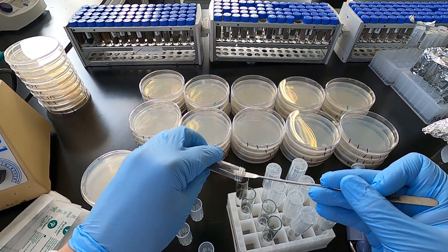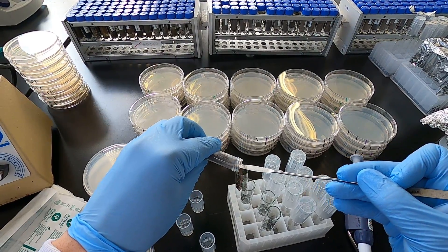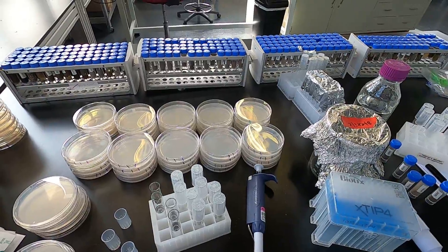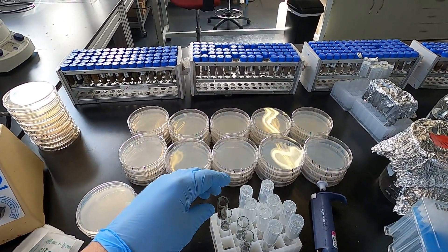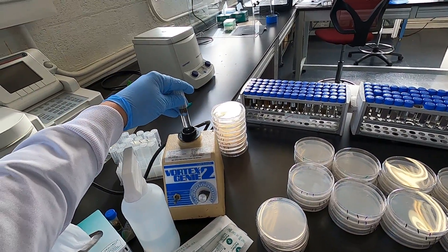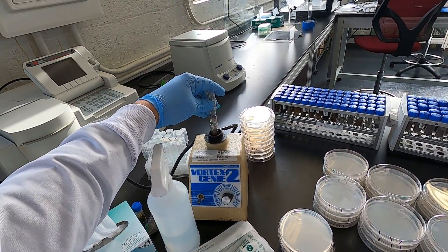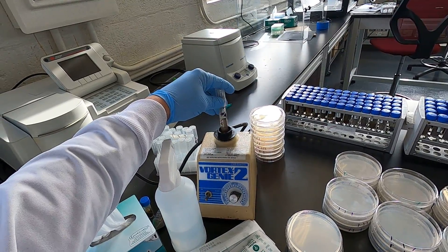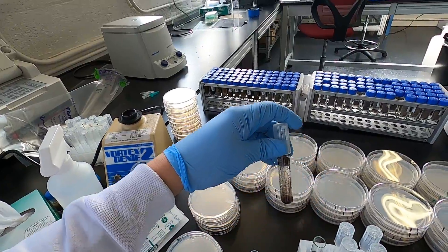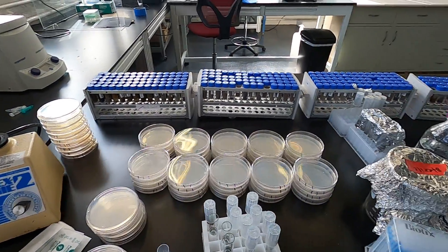You want to scoop some of your dirt in. Some people weigh out exactly one gram. In this particular case, I just want bacteria on a plate. If you do multiple samples, you can sterilize the spatula. Vortexing it helps to dislodge any cells or spores. Letting the solids settle is also helpful.